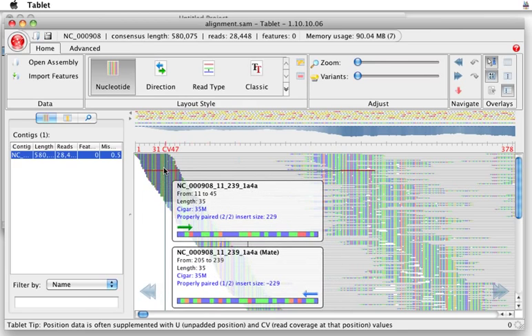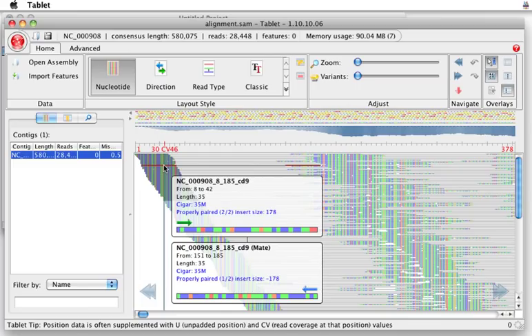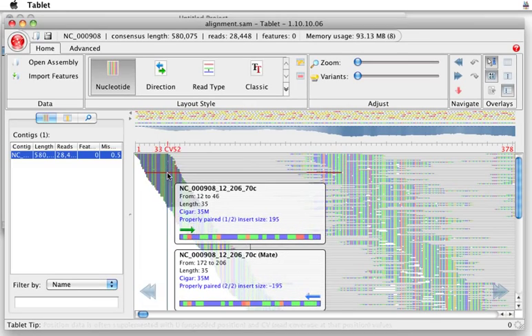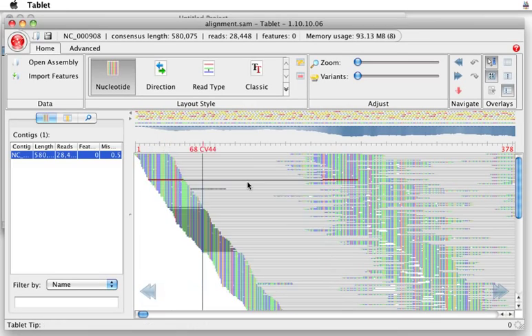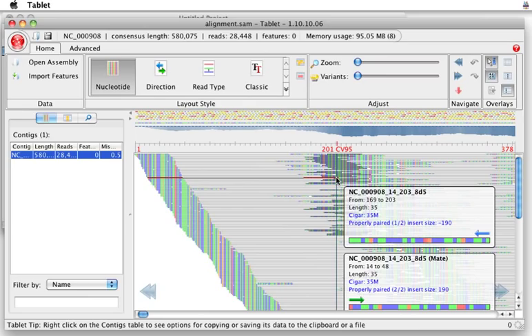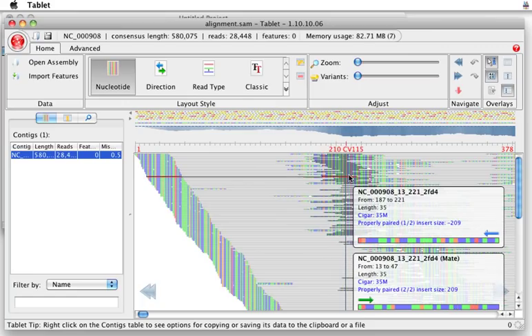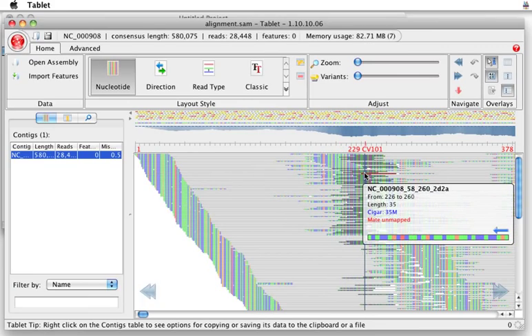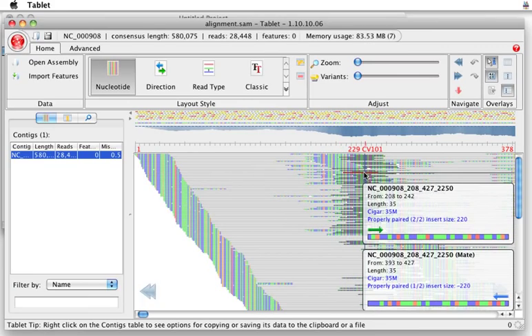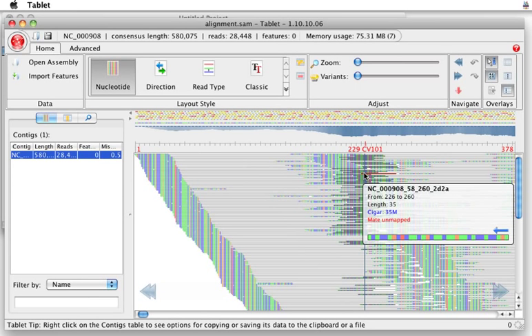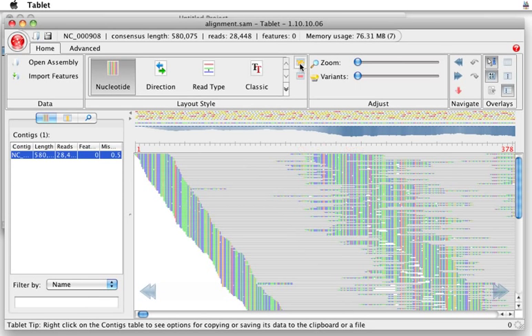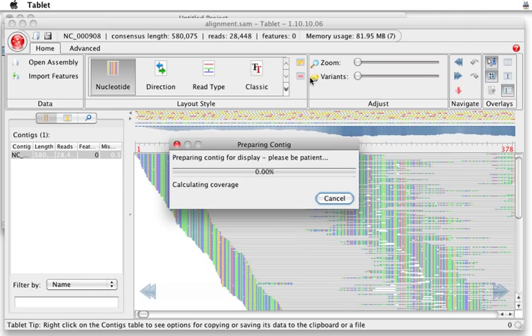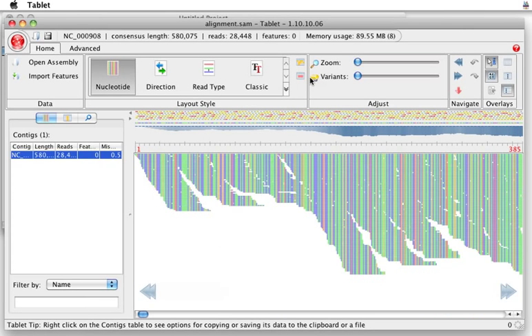And I can even do packed view with my paired ends lined up. So you can see the red line where the sequence finds its mated pair, either to the left, or in this case, to the right. In this case, here's one where the mate was not even mapped. Can I go back to the packed view for a moment? Tablet was developed in David Marshall's group at the Scottish Crop Research Institute, particularly Ian Milney and some collaborators there.